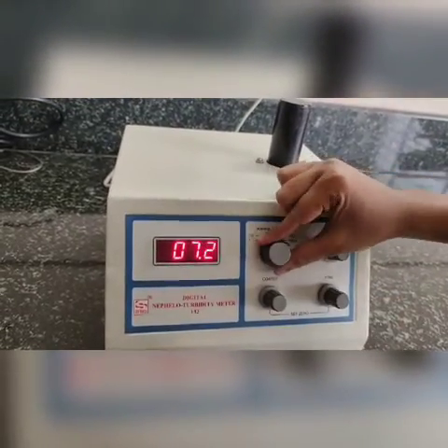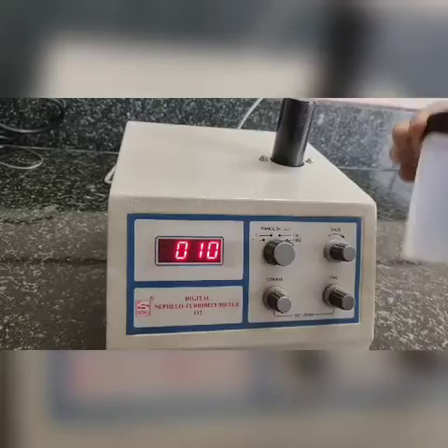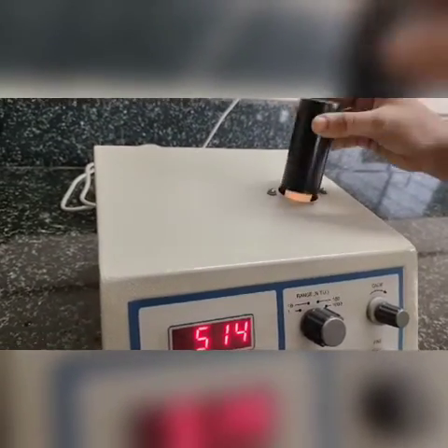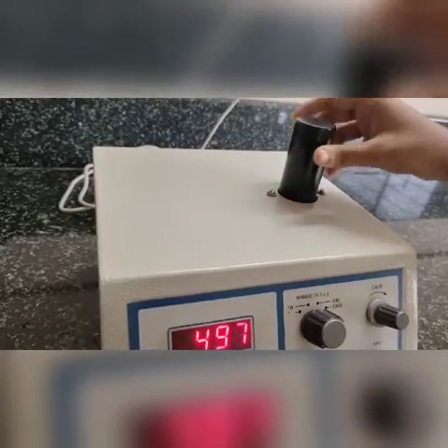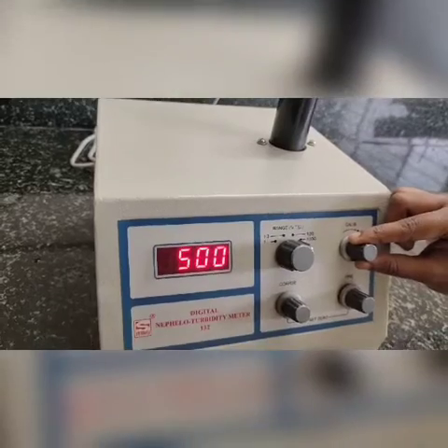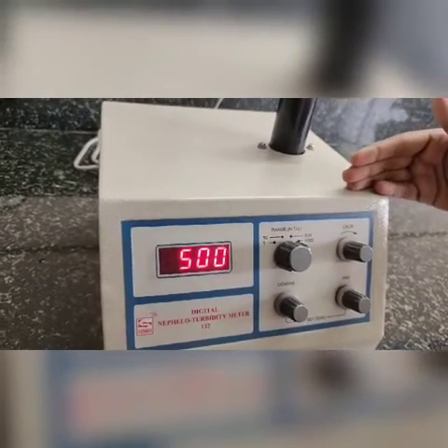Now we will calibrate for 500 NTU solution. Rotate the range to 1000 NTU, then place the bottle or test tube and use the calibration knob to adjust the display to read 500. The calibration procedure is now finished.